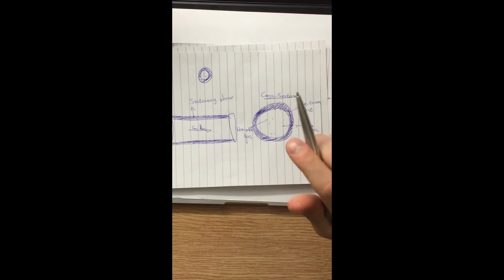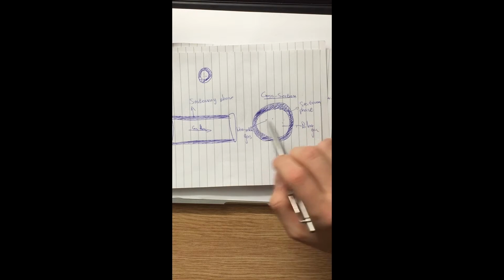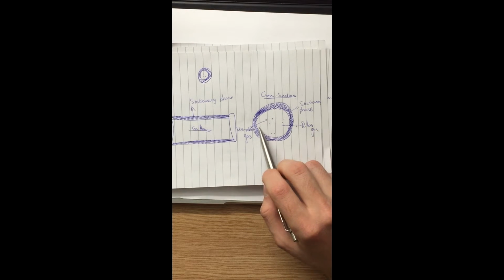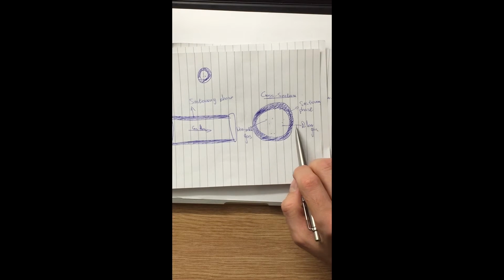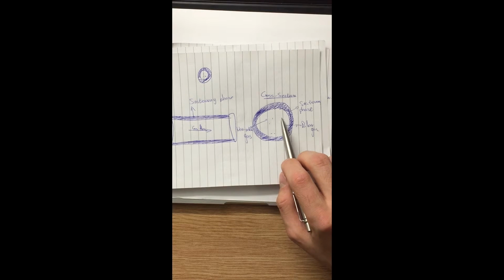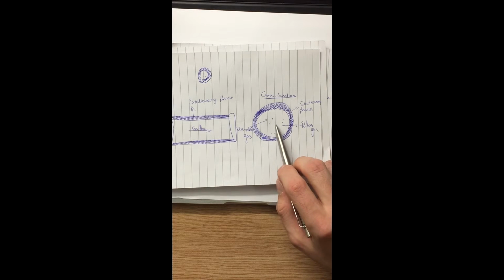Let me show you the picture. We have a non-polar stationary phase and 2 gases. So this is the stationary phase and these are the 2 gases: a non-polar gas and a polar gas. The non-polar gas is going to stick in the stationary phase for a longer time compared to the polar gas because the non-polar gas is soluble in the non-polar stationary phase.